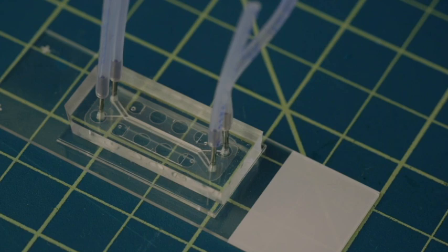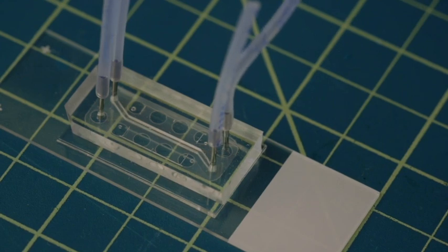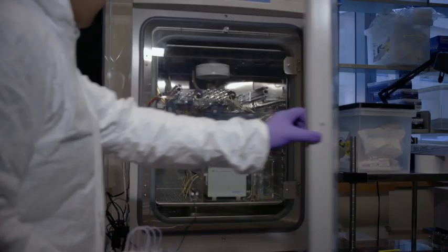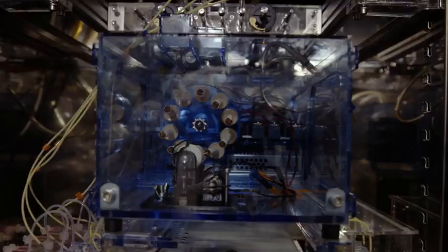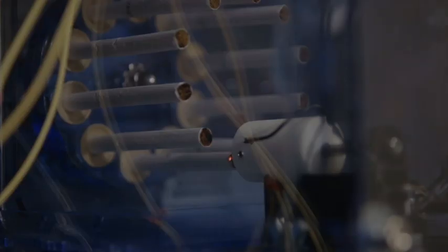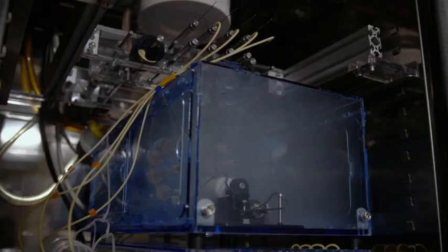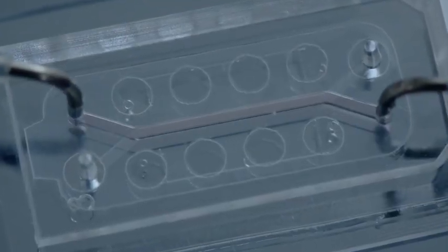And a logical next step on this was to see, could you actually see what would happen with cigarette smoking? With the organs on chips, we have the cell tissue organ level, but we had to develop an apparatus that would hold cigarettes, that would light cigarettes, that would control puffs, and then would collect the smoke and deliver it to the air channel of our lung chip.